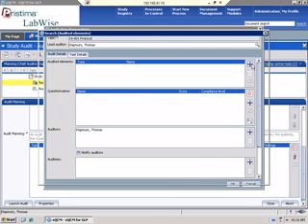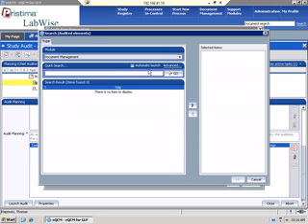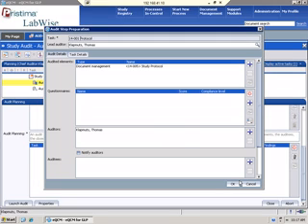The audited element. Again, you can go into your document management and find the actual protocol. If you have questionnaires, the system allows you to build a questionnaire for the audit. I don't have a questionnaire for a protocol, so I'll cover that when we go into the facility. Here's where you define the auditor. So again, I'm going to be the auditor for the protocol.